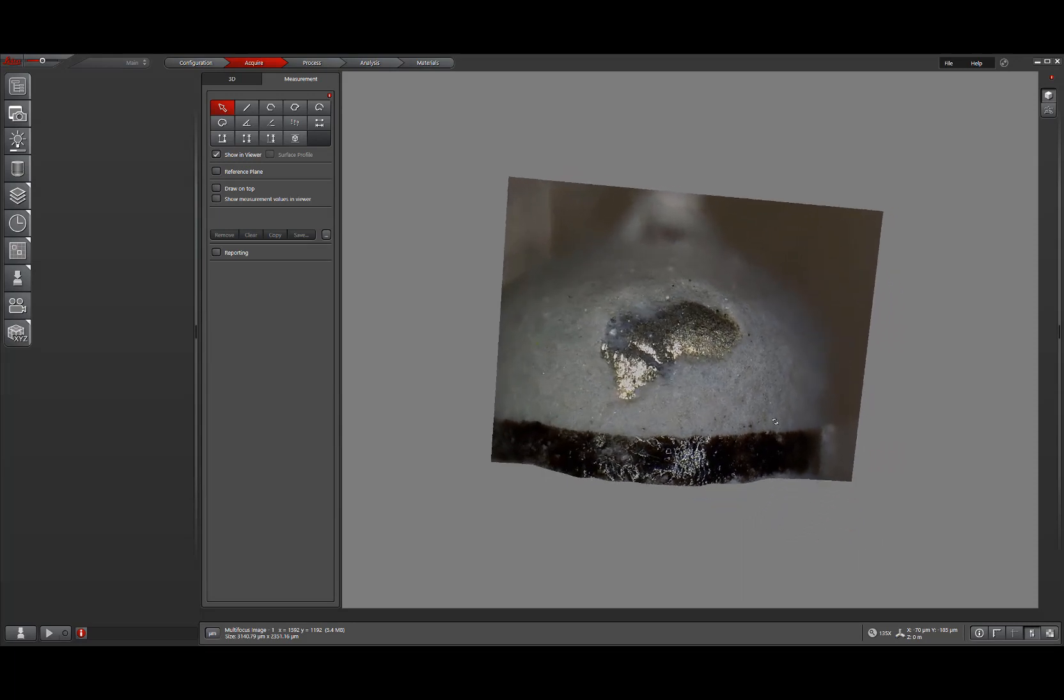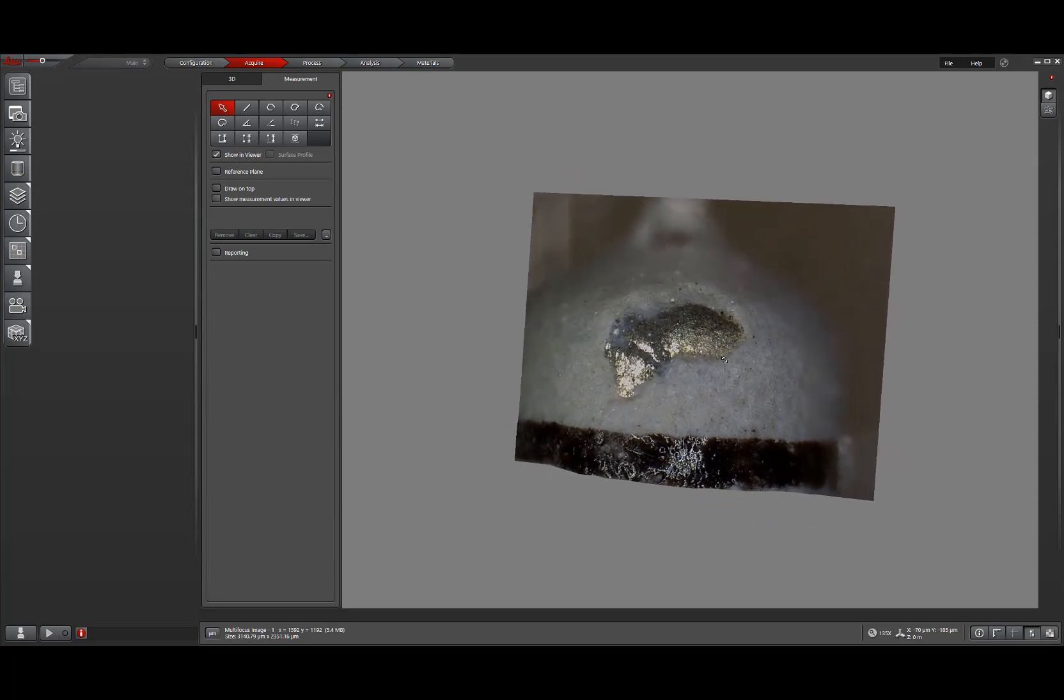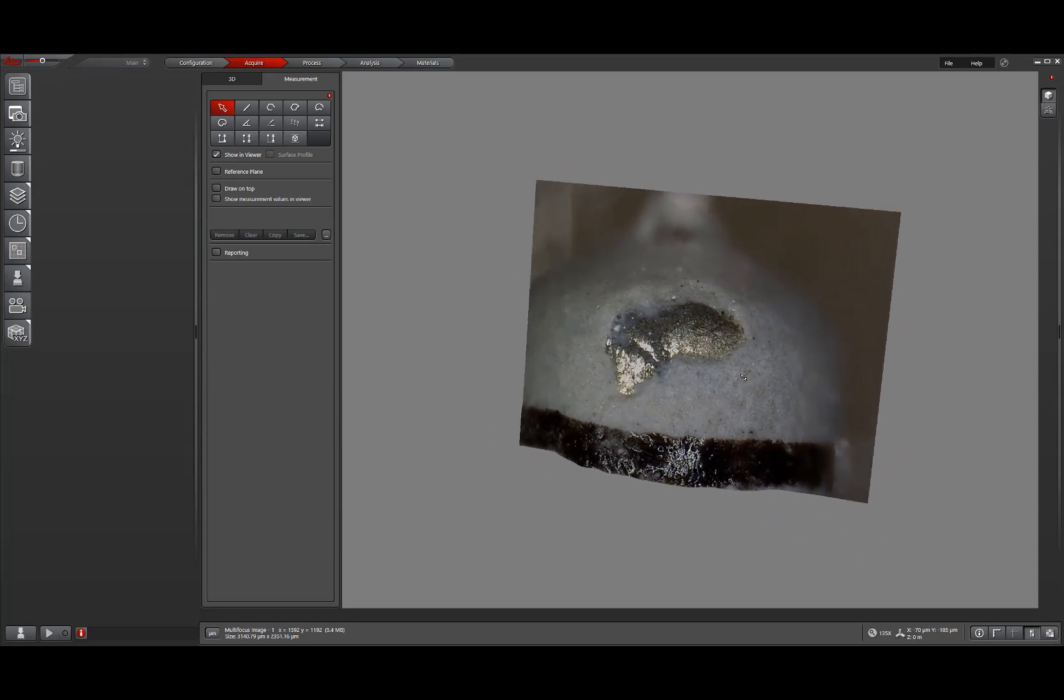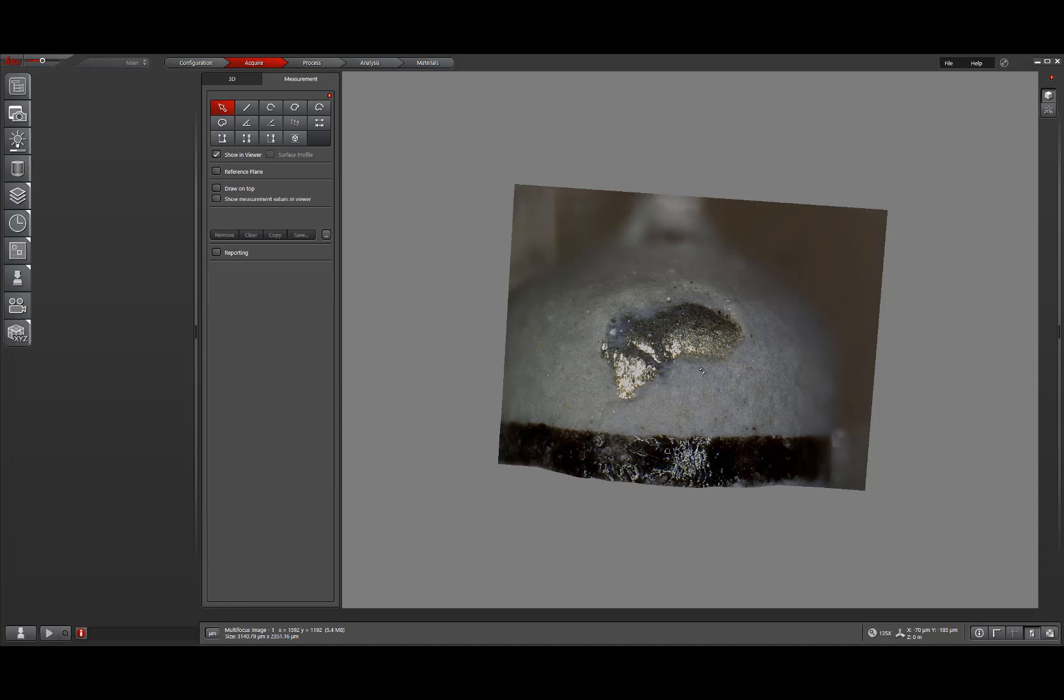Everything inside the 3D surface view is the same as in LASX version 3. The one change here is how to go back to the regular view. You can do this in two ways. The first by clicking the play button in the bottom left corner. That'll pop up a live image screen. Or if you want to go back to viewing your multi-focus image, just not in the 3D view, we can simply click our 3D surface view button, the same one we did to enable this mode to disable it.